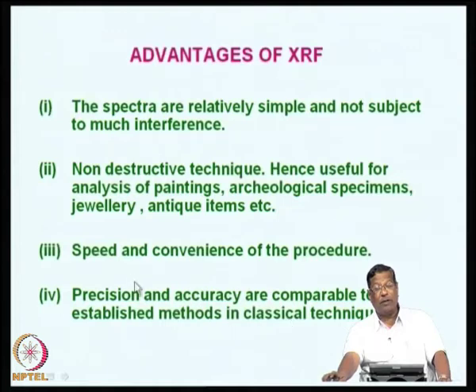This is very important, because in classical techniques the chemical analysis can match maximum ppm levels, not lower than that. So, in general XRF can be used for the analysis of such substances in ppm levels.